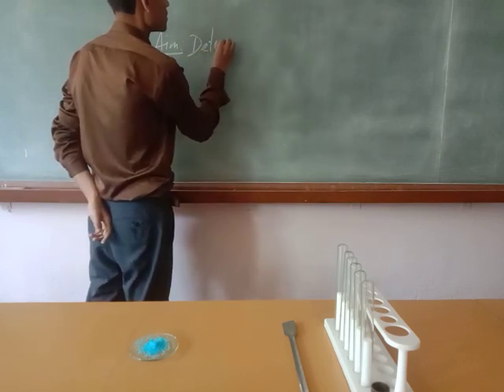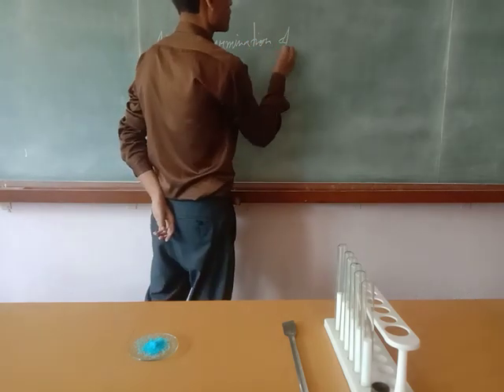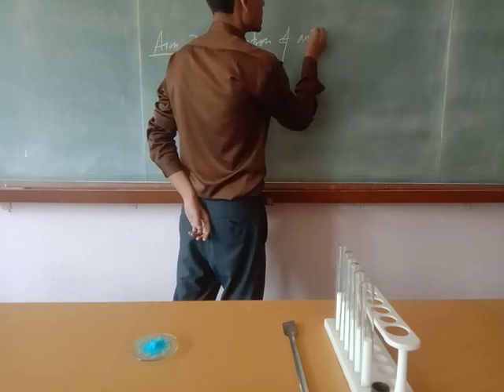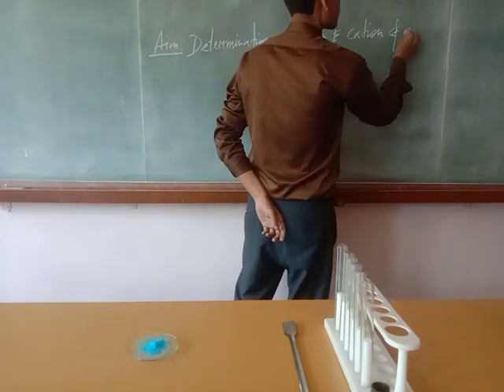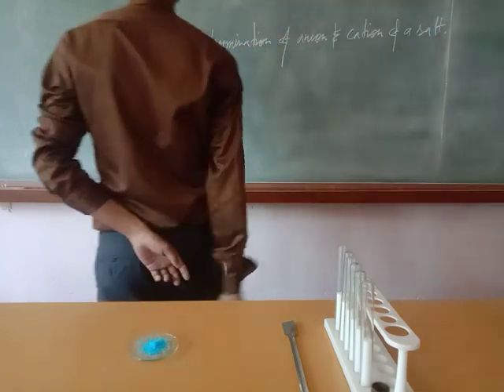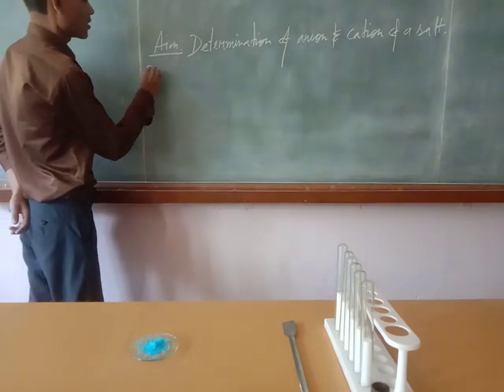Determination of anion and cation of a salt. So this is our aim of the experiment. Then you write physical observations.